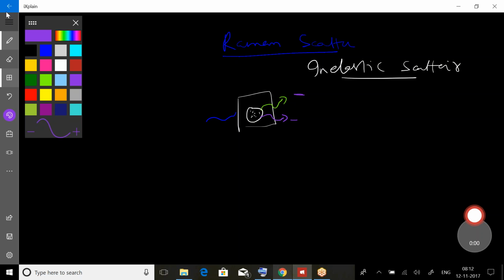Now, how are Raman scattering and fluorescence going to affect me, or give me information about the cell? Say we have cells with certain fluorochromes, using some reagent conjugated to the fluorochromes that binds to the cell, such as an antibody.